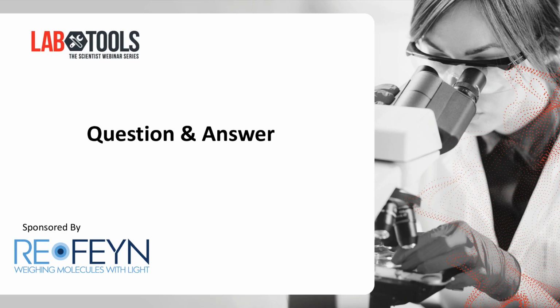Great. Here's a question about, at some point you mentioned that about 30% of the spike protein was glycosylated based on your studies. It's a question about controls for that experiment. Have you tried to deglycosylate the spike trimer and then repeat your experiment?